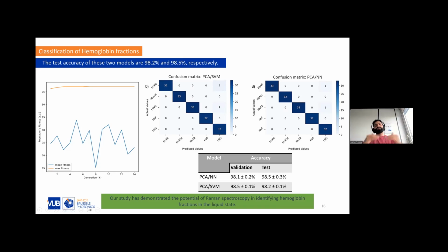And then we do this classification multiple times in order to make sure that our random states, the decisions that we make along the algorithm that are a bit automated or randomized, don't influence our results much. So you can see that we get a validation accuracy of about 98 something % for the 2 models, and then a test accuracy that confirms how my model works on an unseen test set.